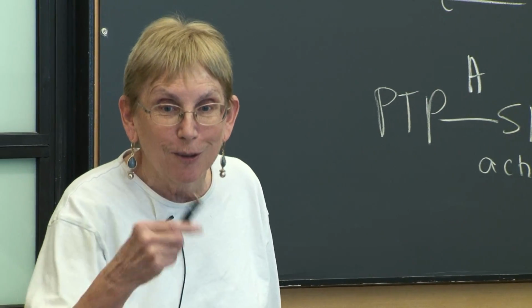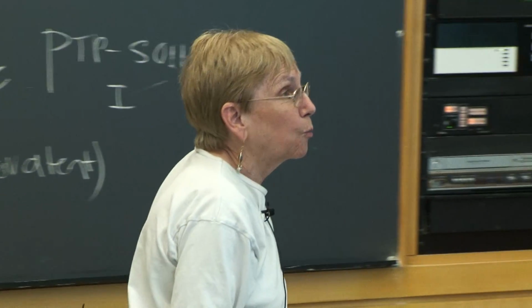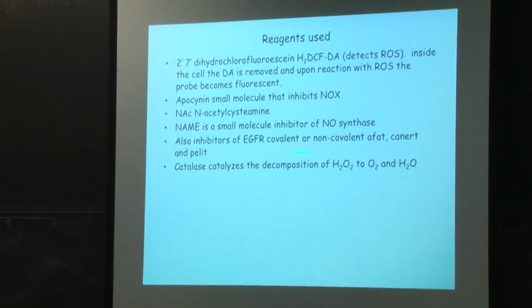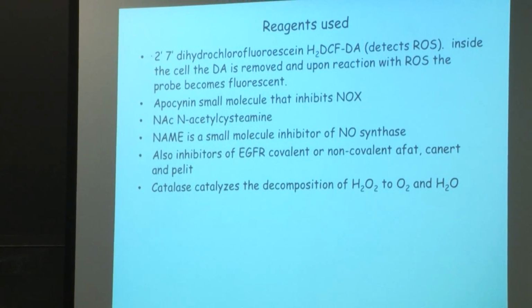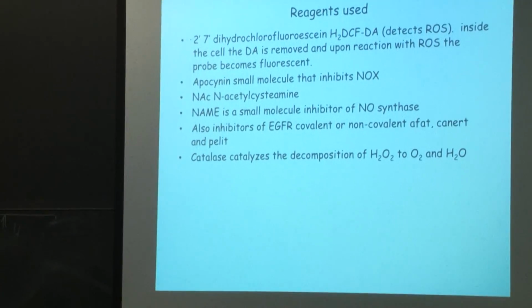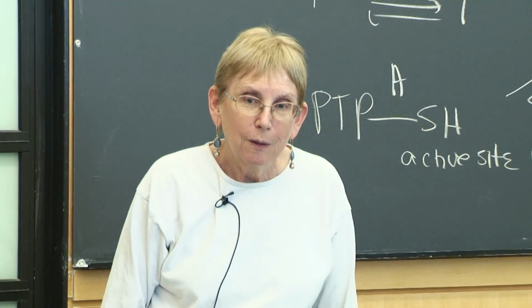So there are a bunch of different isozymes. People are really interested in these therapeutically, so people have developed specific inhibitors. If you look at these guys, which they call the wrong thing, they have a longer name, but these are covalent and irreversible inhibitors of epidermal growth factor receptor. Okay, so you need to know that to be able to look at each one of these panels to figure out what the data tells you.